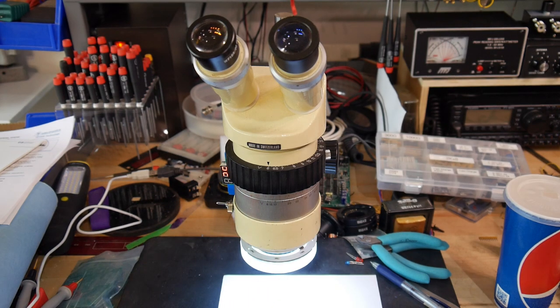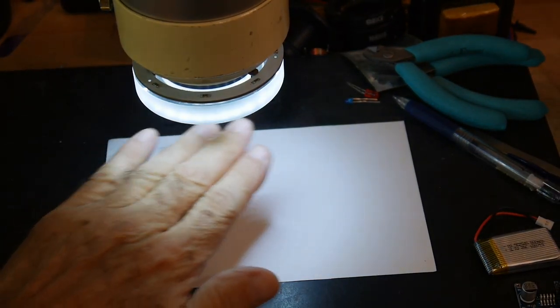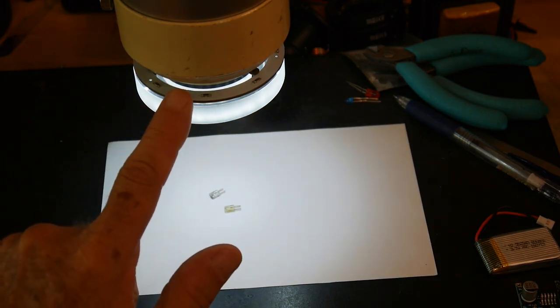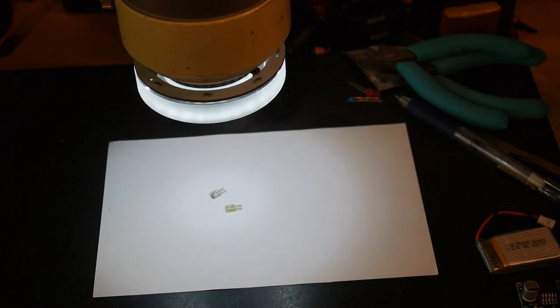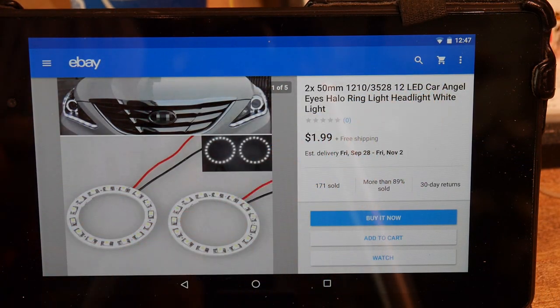You can see the ring light here — it gives nice lighting. And you can get these for just a dollar or two. Let me show you an eBay listing. The trick is to search on "angel eyes."